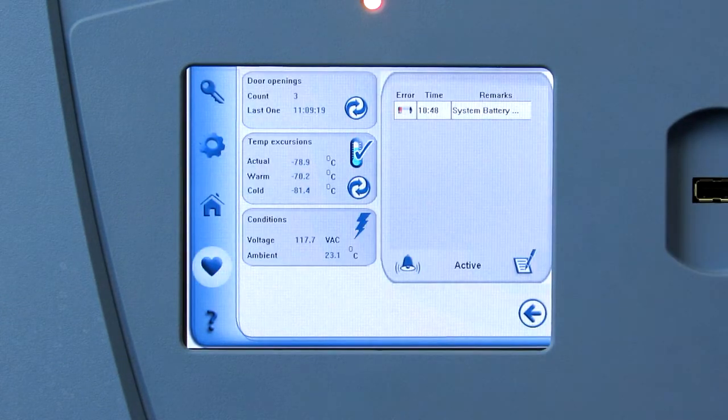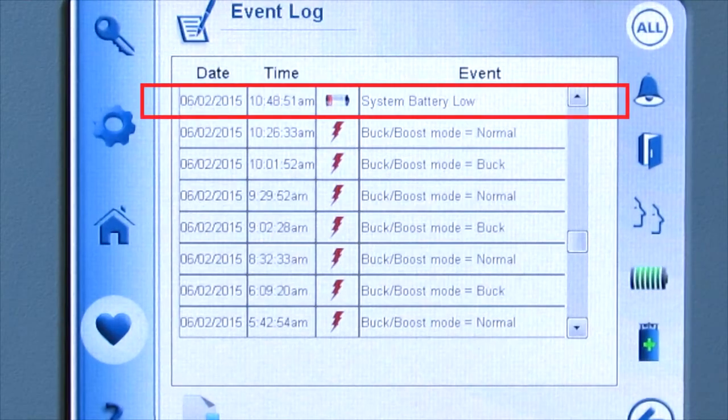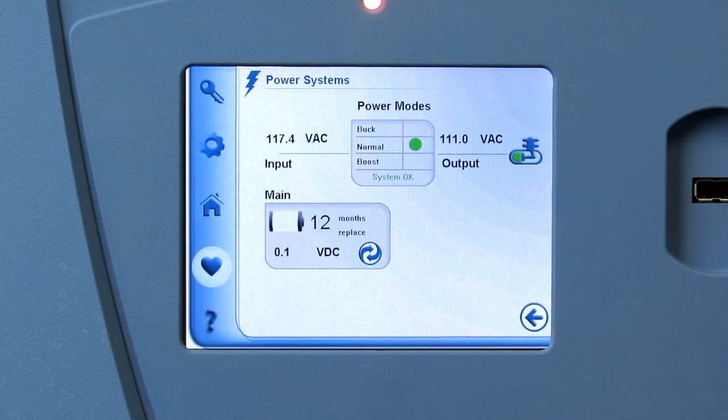Touch the heart to view the health status of the freezer. The alarm will also be displayed in the event log, and you can touch the lightning bolt icon to see the battery details on the power system screen.